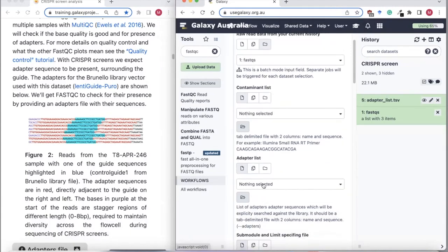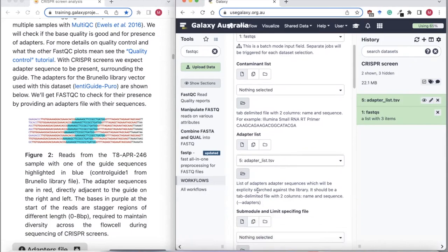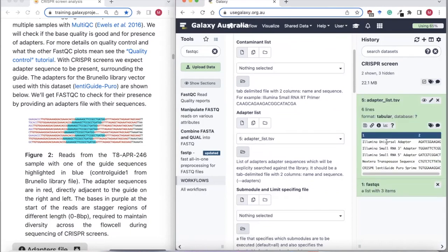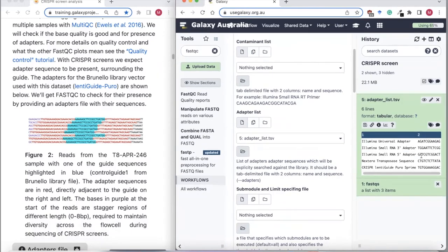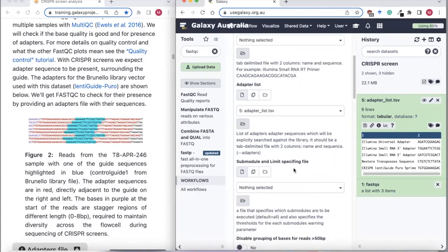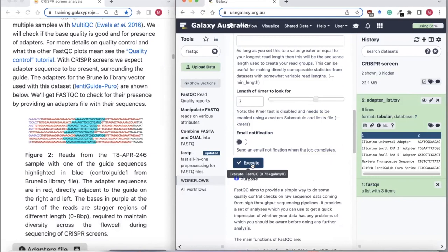We've selected our FASTQs and now we're going to select our adapters file. FastQC will explicitly look for these adapters. If we peek in this file, the first four sequences are ones FastQC looks for by default, so we'll include those. We've added two more that are CRISPR sequences — the regions in red around the guide. I'm going to run that.